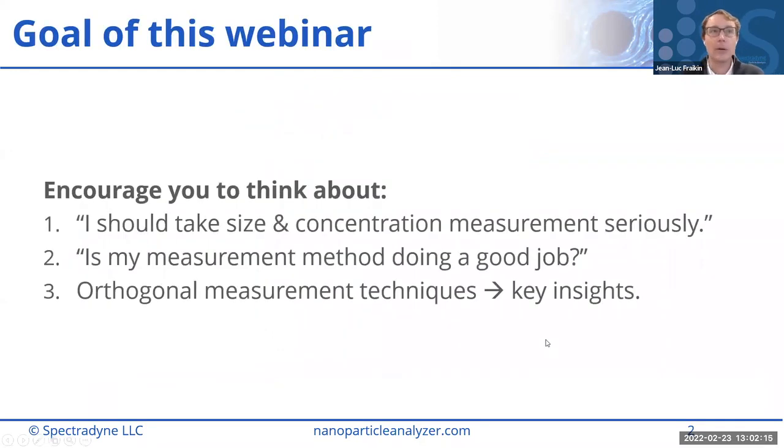My goal for the webinar is to encourage you to think about three things. First, that you should take particle size and concentration measurements seriously because they're critical experimental parameters, and controlling them better can help your science. Second, I'd like for you to be asking yourself if your measurement technique is doing a good job of delivering the information you're asking it to. And so we'll investigate the limitations of different techniques to get at that question. Then finally, I hope the examples I'll show today will convince you that using multiple measurement techniques can provide key insights for your research that you can't get from any single method on its own.